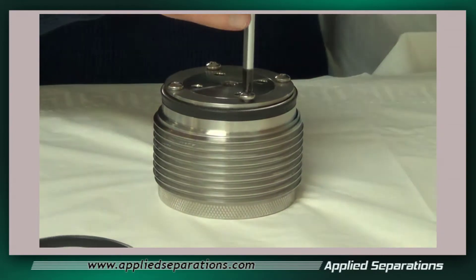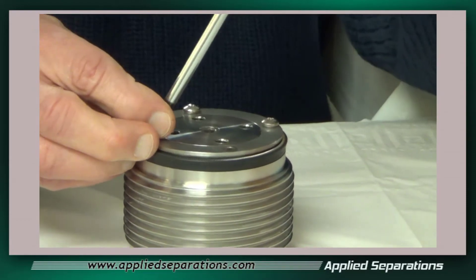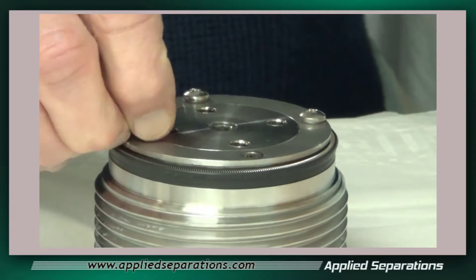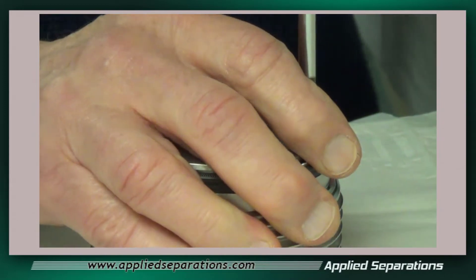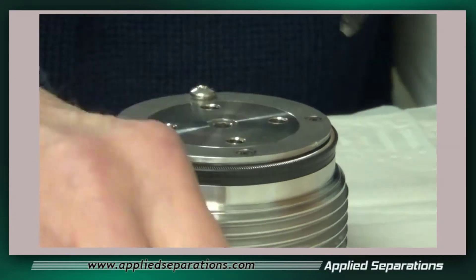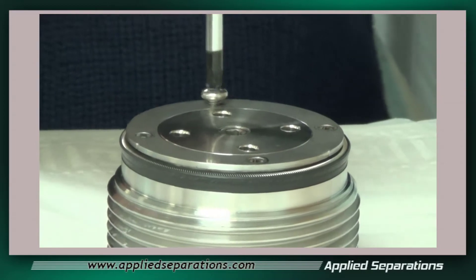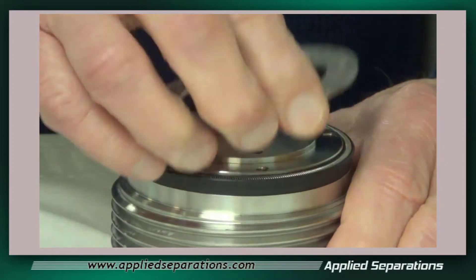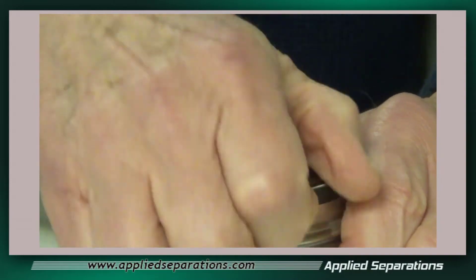We want to remove the cup seal retaining ring. We take the retaining ring off and we can just pull this cup seal off.